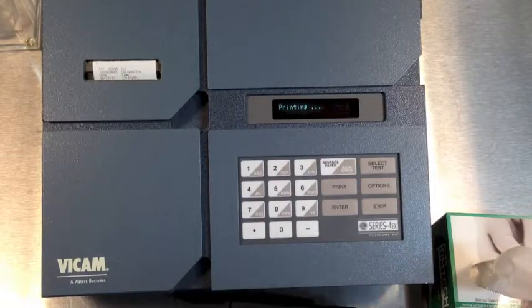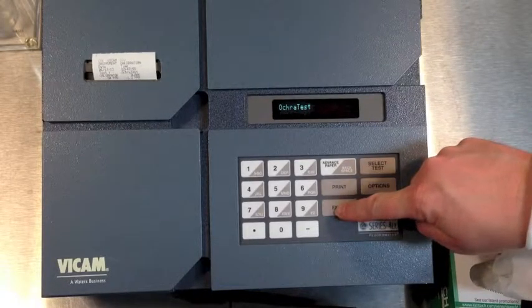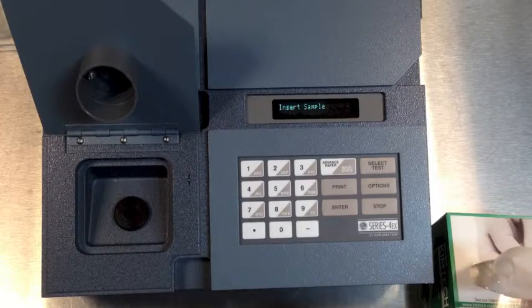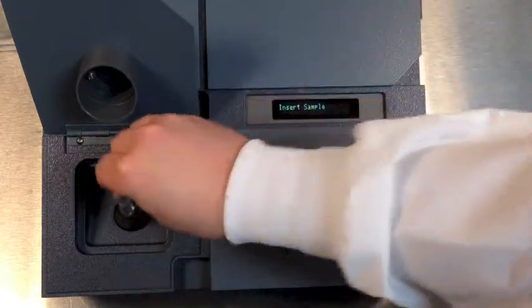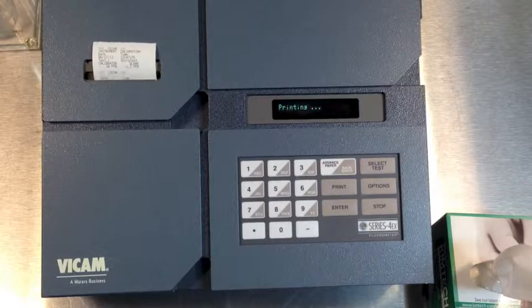The machine will now print a time-date stamped record of calibration. To test the calibration, we will run a known sample with the yellow vial. Press Select Test, choose OchraTest, insert the yellow vial. Close the lid and then wait for results. Your results should fall into the range found in the current procedures manual.